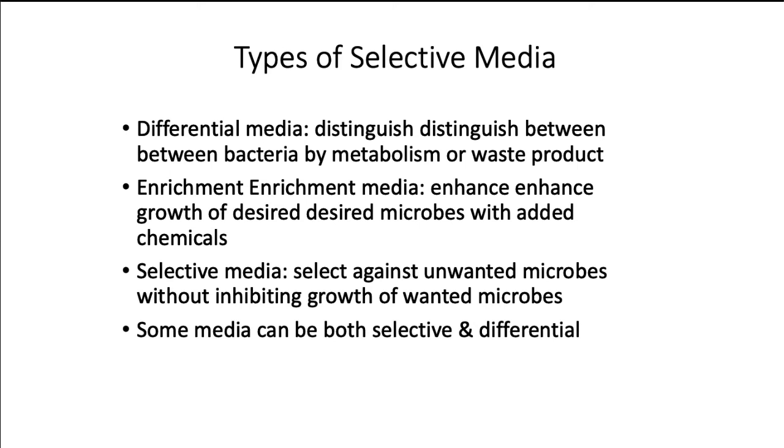You are testing for bioremediation, and you want to look for bacteria that are able to degrade some kind of environmental poison. Well, how can you find those bacteria? You add whatever that substance is to your medium, which is going to help the desired microbes to grow.